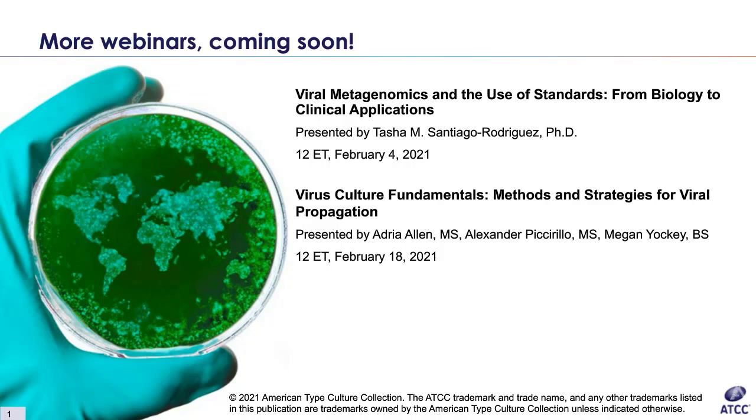All right, so we all have experience with UV light being used to keep the microbial load down inside your biosafety cabinet. Mm-hmm. Can ultraviolet light sterilize the medium flasks? I don't know if they mean just the flask or the medium in the flask. I guess we can try to answer both.